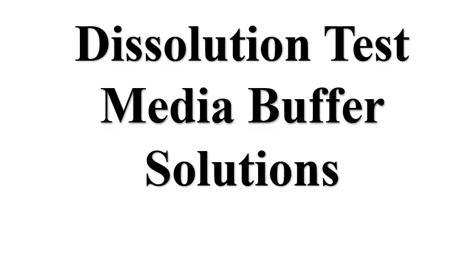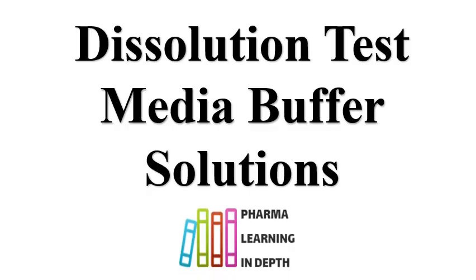Dissolution testing is a performance testing for the formulations and selection of the dissolution media. Selection of the dissolution media as buffer solution is very important and critical in the dissolution method development. This video is regarding the buffer solutions used as the dissolution medias.